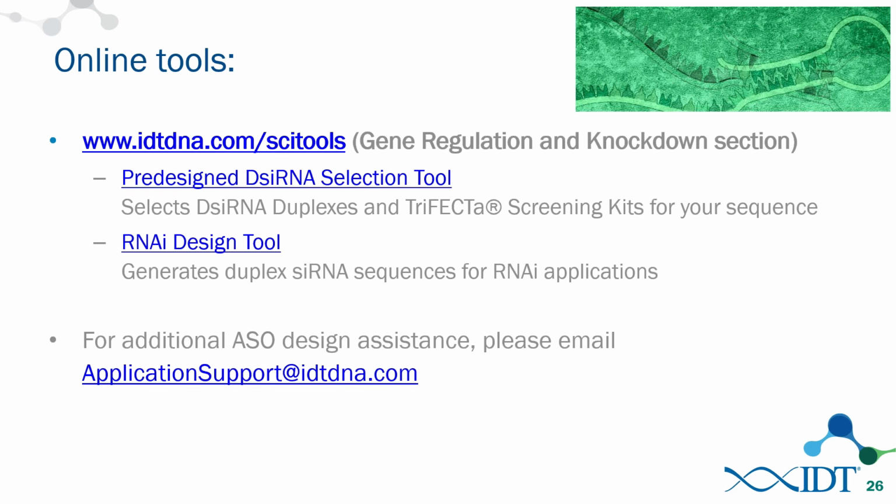And I think this is a very similar question. Transfection is transient, so how long will the siRNA work and inhibit signaling? I've not done that for the long non-coding RNAs, but for a messenger RNA, for the dicer substrates, for unmodified dicer substrates, we've seen effects lasting up to 5 days. And after 5 days, that's when RNA levels start to come back. And that was done in HeLa cells, so those are considered to be rapidly dividing cells.